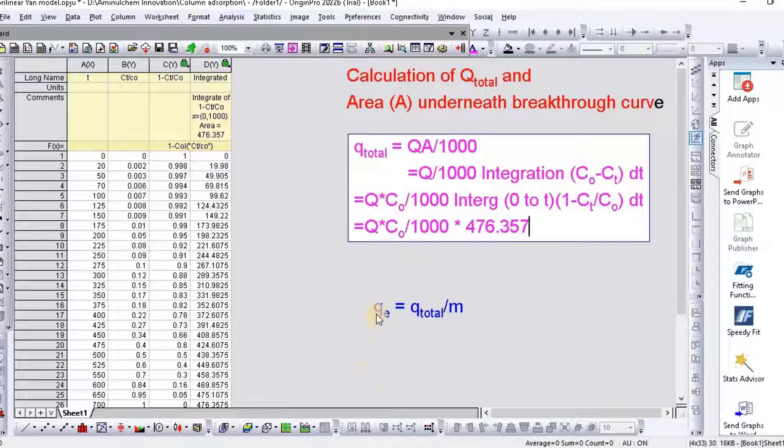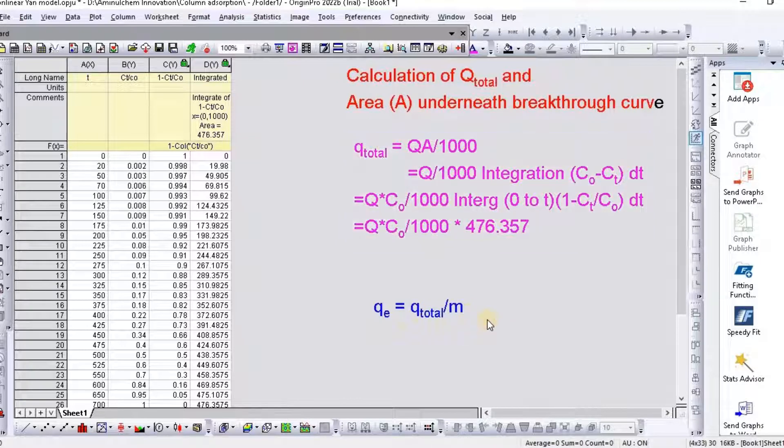So after this, you can also calculate QE equal to Q total divided by M. So this is how you can easily calculate area underneath breakthrough curve using Origin Pro.